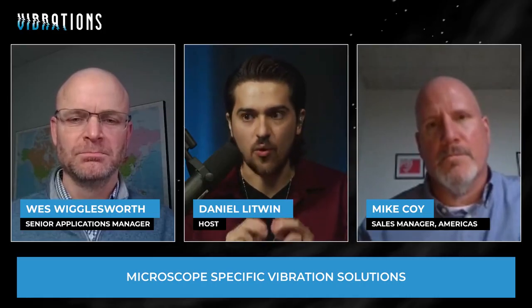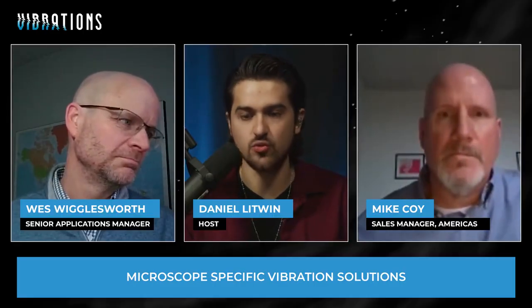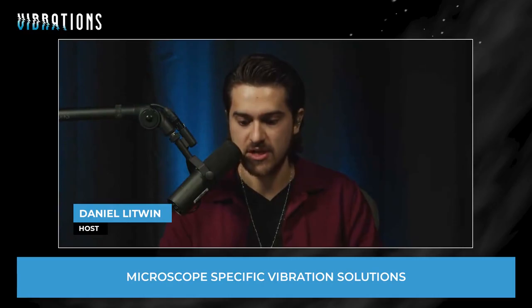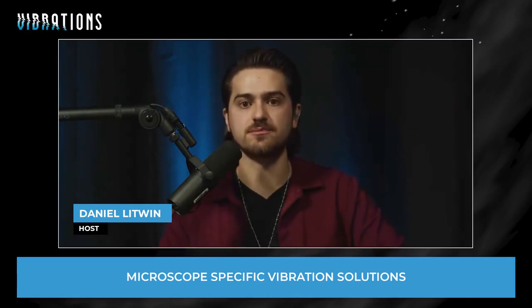Can you explain the importance of vibration criteria curves, VC curves, in this process, and how you would even approach, for someone out there who's investing in new solutions, or they're retooling their existing production or research ecosystem, right? How would you even begin to approach determining whether a site meets the necessary conditions for microscope installation in the first place? So again, explain the importance of VC curves for us, and then how you approach determining if a site is correct for an installation.